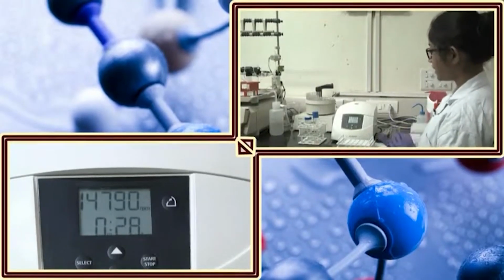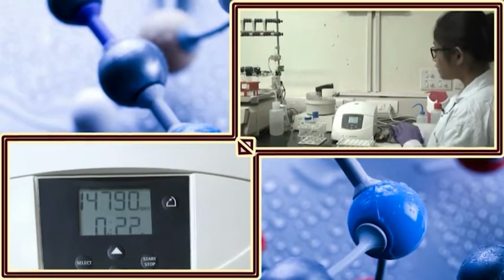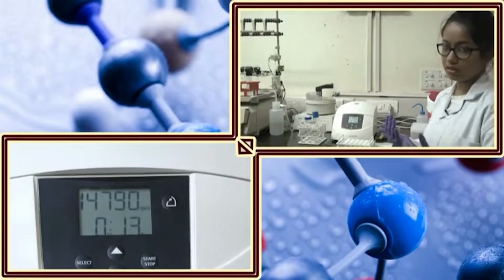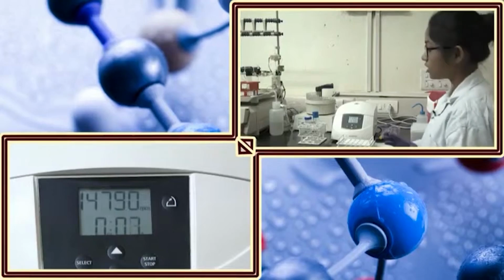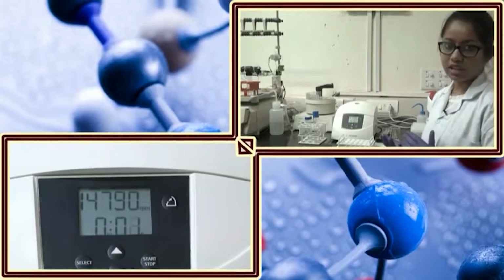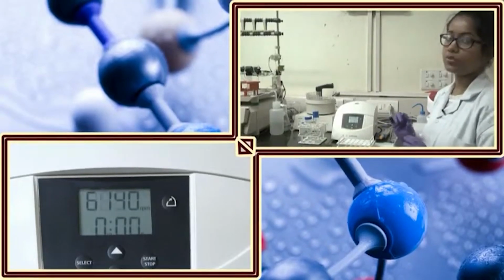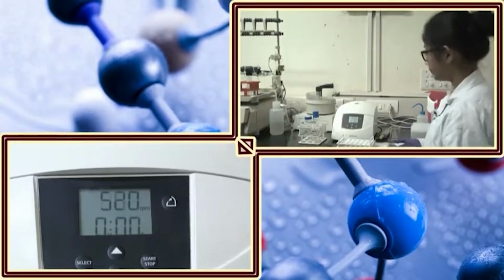So, here I am actually pelleting down the cells at the highest speed for 1 minute or more than 1 minute 15 seconds. If you feel that the supernatant is not properly clear or the cell pellets are not properly formed, then you can increase the RPM or RCF, or you can increase the timing as well. In most cases, if you are pelleting down from 50 ml or 15 ml of culture, we go for 10 to 15 minutes at around 3000 or 5000 g. If you do not have that much, at high speed 1 minute is enough. So, you should always check the supernatant. If you feel like the supernatant is not properly clear, then you go for higher speed and or higher time.